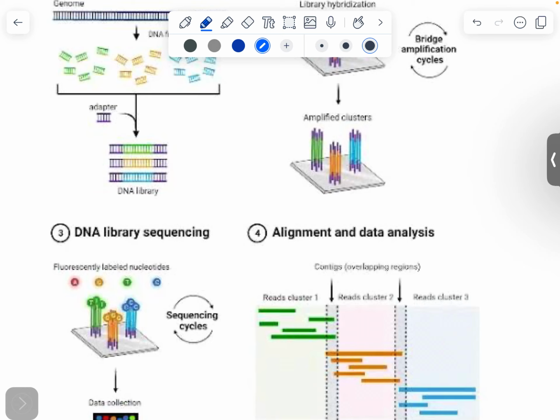When we have multiple copies for a target DNA, we can eliminate the bases which are not common among all the reads. Suppose we have 10 reads. Out of these 10 reads, suppose 3 reads have a mismatch with the reference genome.